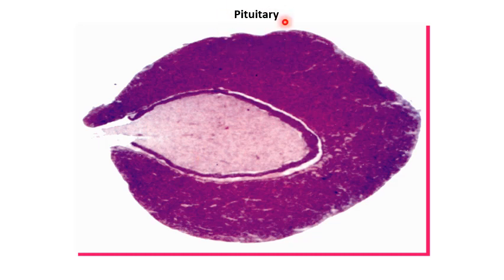Here is the pituitary. It is a very easy slide. Here is the pars distalis, and here is the pars nervosa. Here is the pars intermedia, and here is the cleft. It is an easy slide.